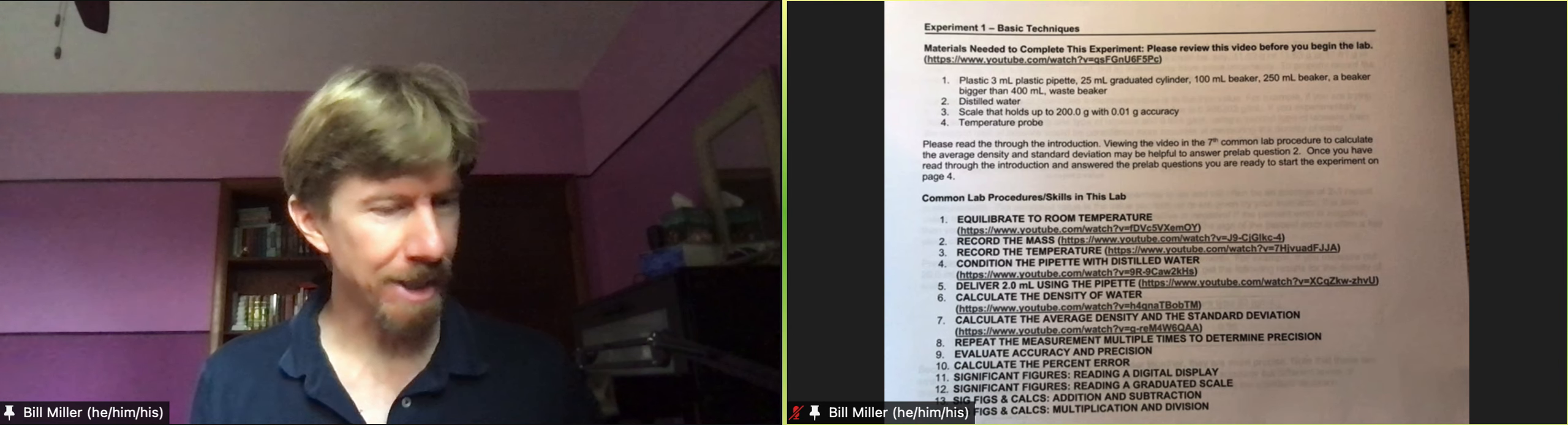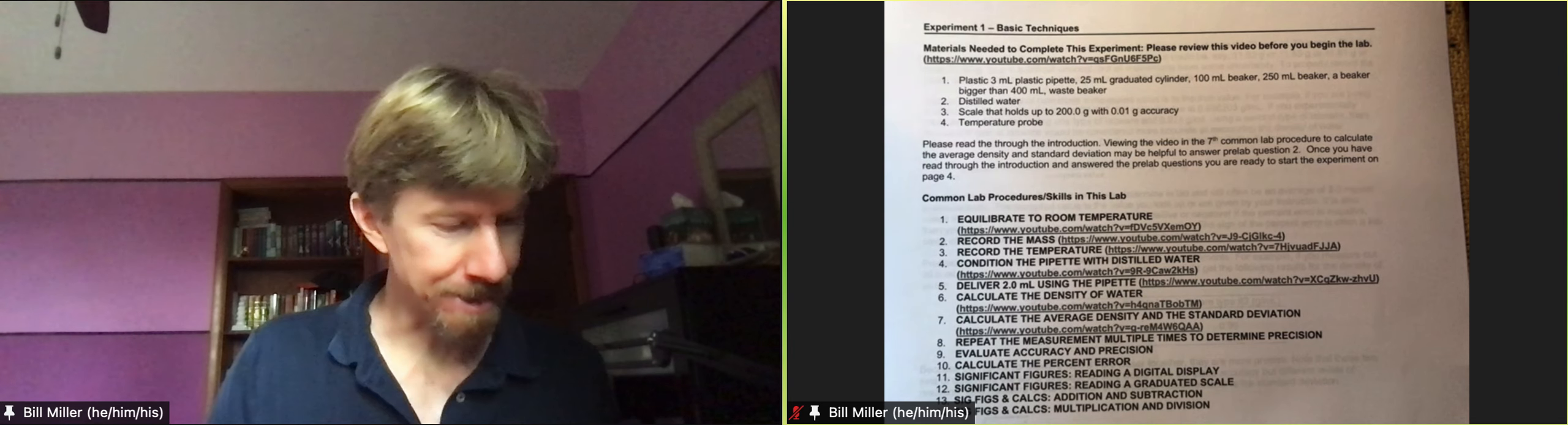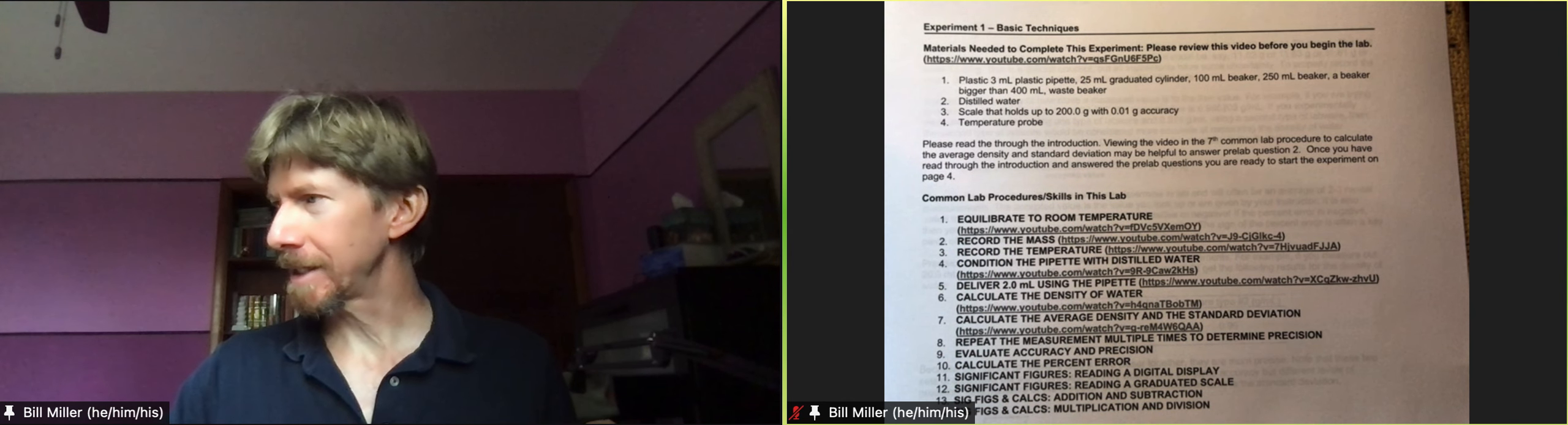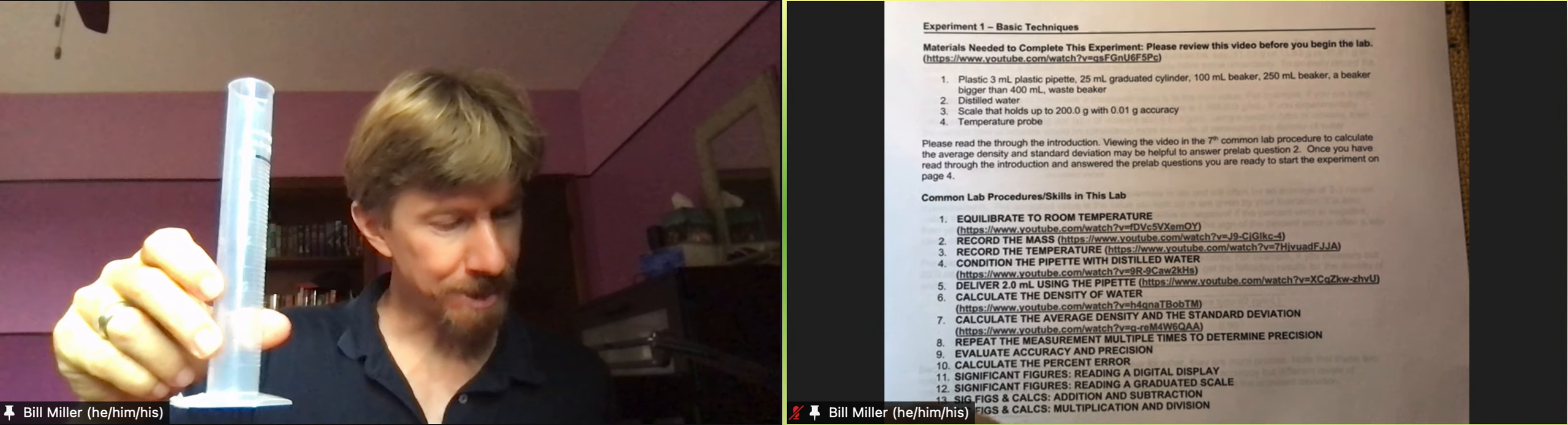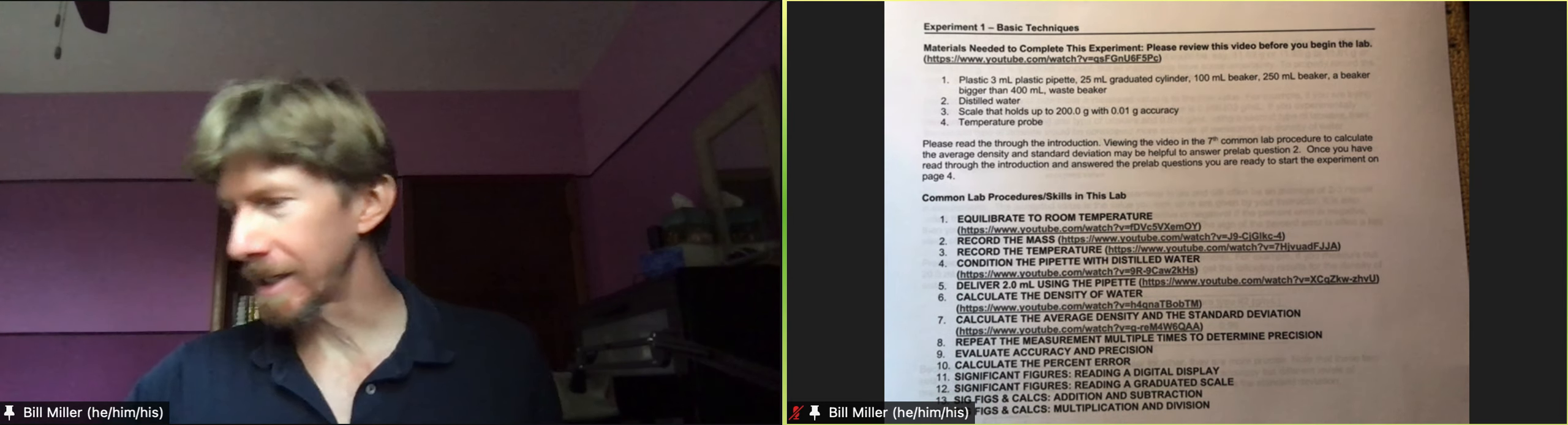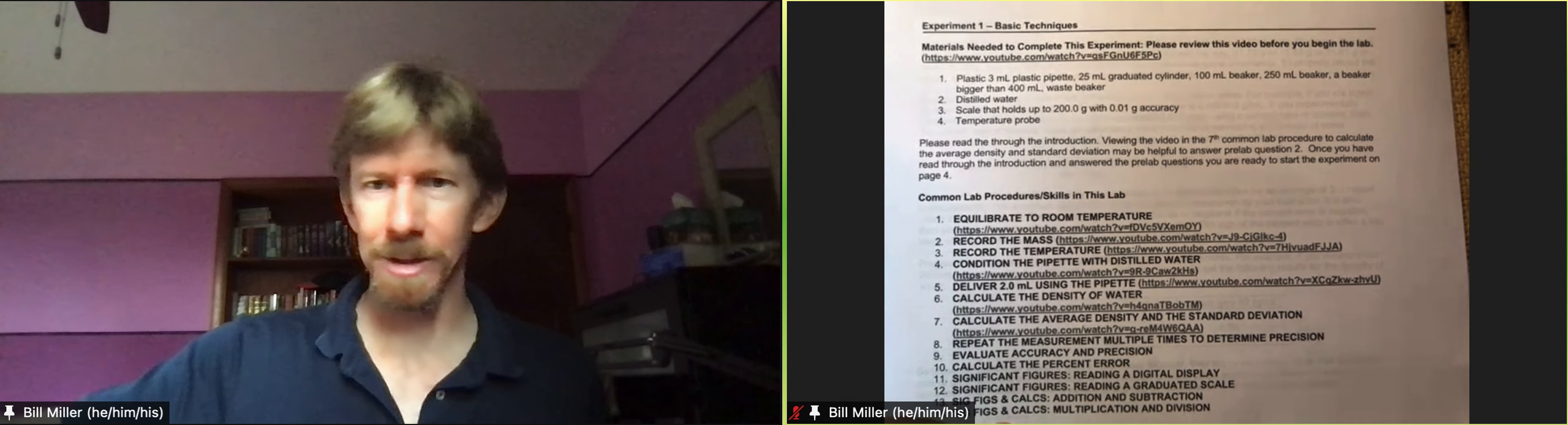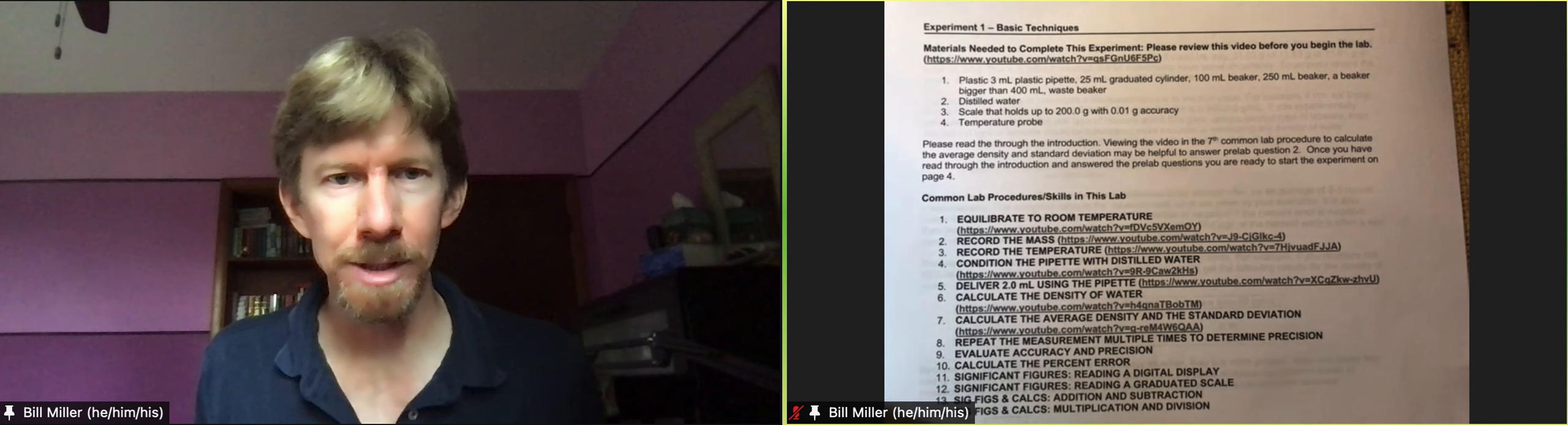So I've got my lab printout right here and it tells us that we need a 3 milliliter plastic pipette, a 25 milliliter graduated cylinder. I have my 50 milliliter graduated cylinder, 25 or 50 will work. I've got a 100 milliliter beaker, I've got a 250 or 300 milliliter beaker, either one is fine, these sizes are approximate. I've also got my 50 milliliter beaker here and the 100 and the 50, you can use either one for this experiment.